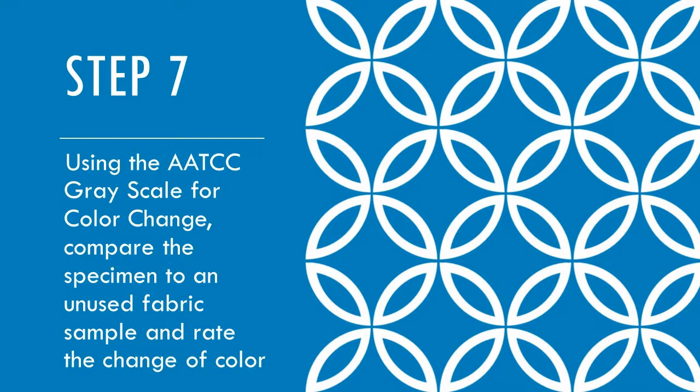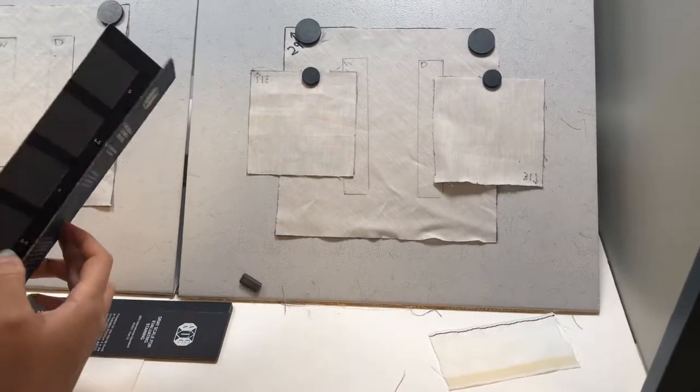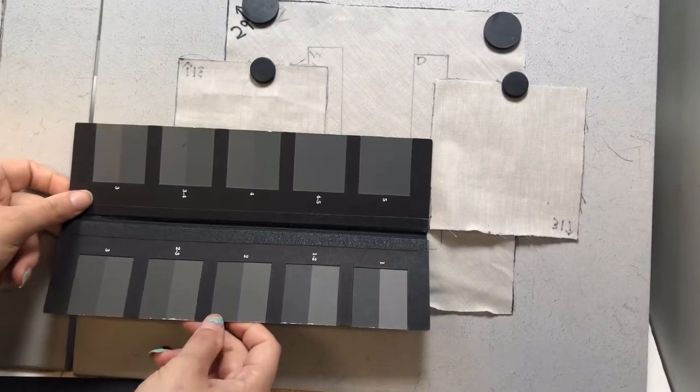Step 7. Using the AATCC gray scale for color change, compare the specimen to an unused fabric sample and rate the change of the color. In this rating scale, the higher the number, the better the colorfastness of the fabric. The highest rating, 5, is equivalent to a very good colorfastness to crocking.